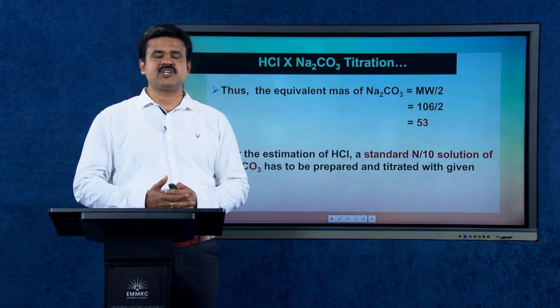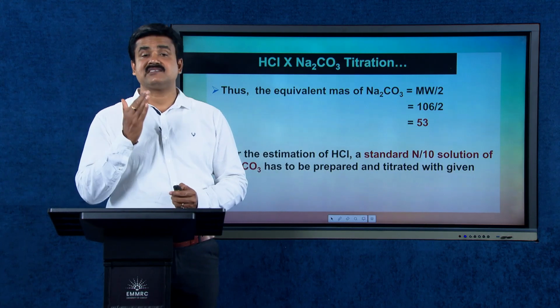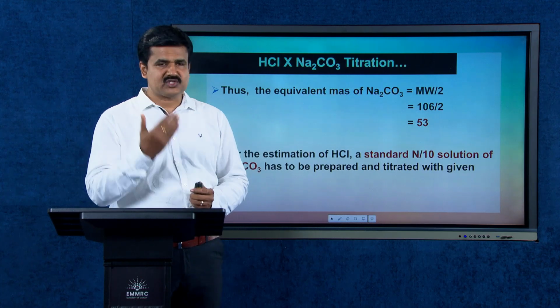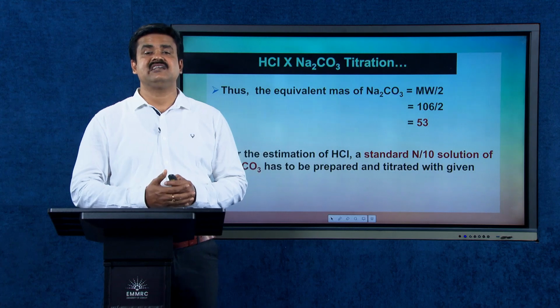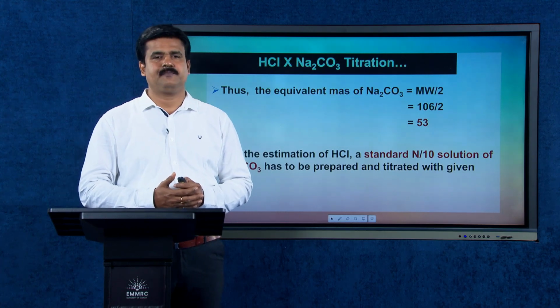For the estimation of hydrochloric acid, a standard N/10 solution of sodium carbonate has to be prepared and titrated with the given HCl.